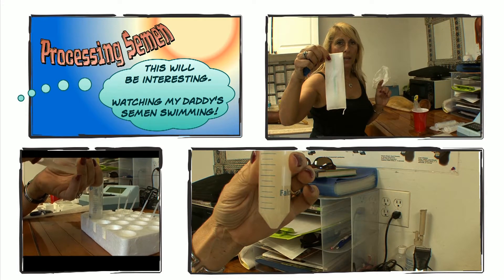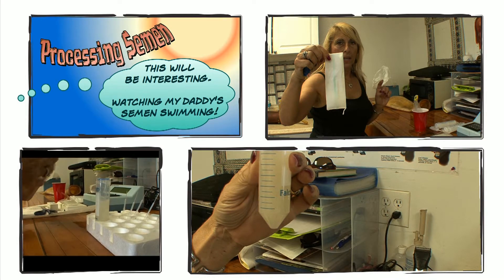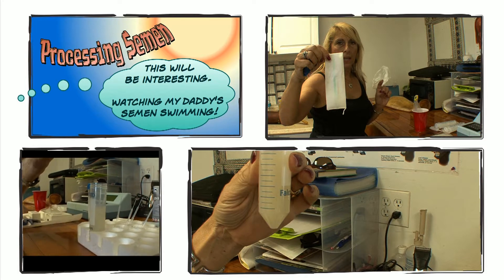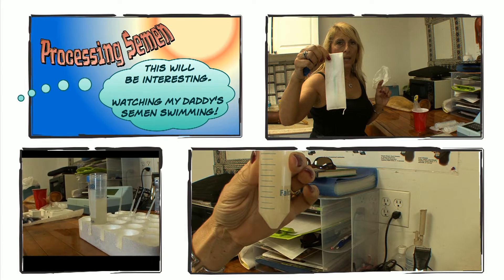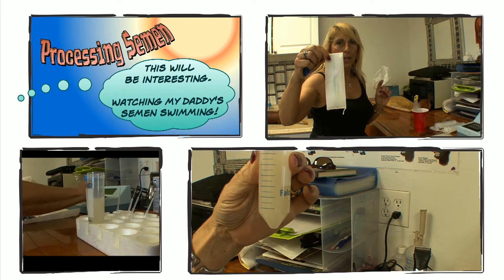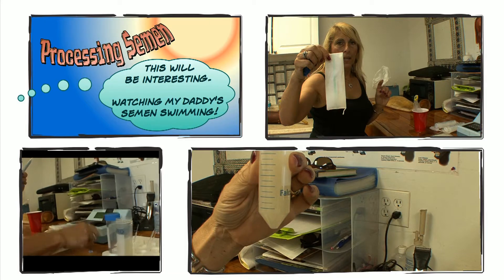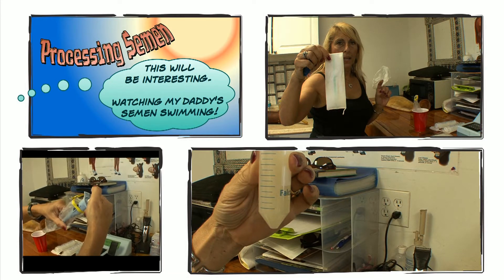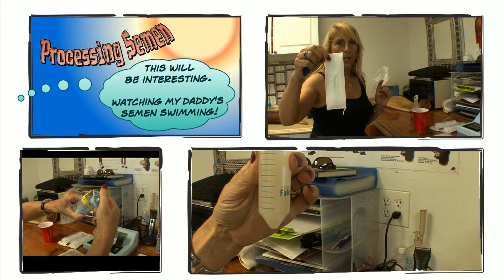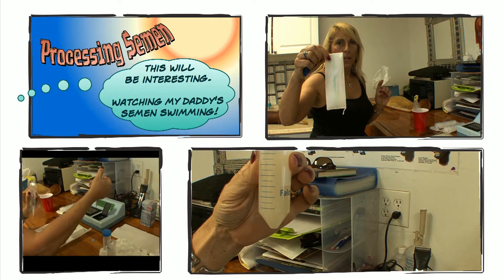We will measure the ejaculate, and I'm going to take a small sample to place in the densimeter. This measures the concentration of the semen, which gives us the mathematical ratio of how to make a prescribed dosage.